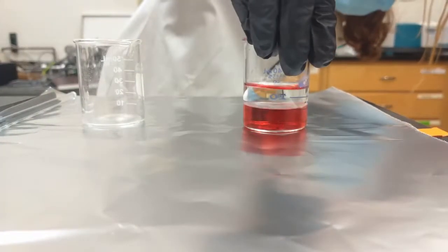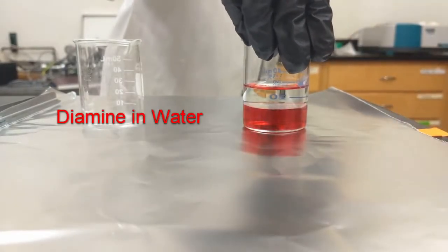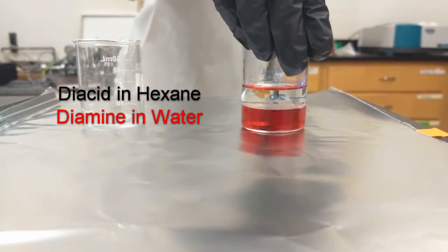Now you can see that we have two layers. The bottom layer is the red water layer and the top layer is the clear hexane layer.